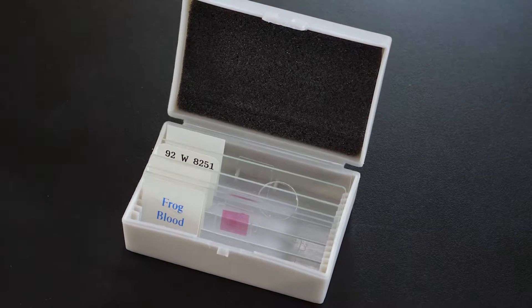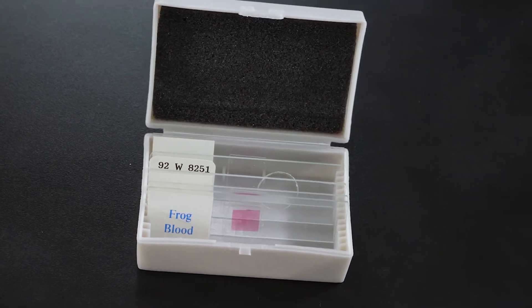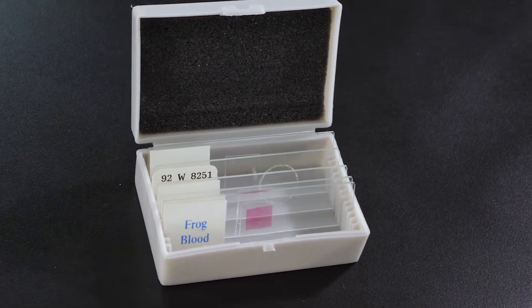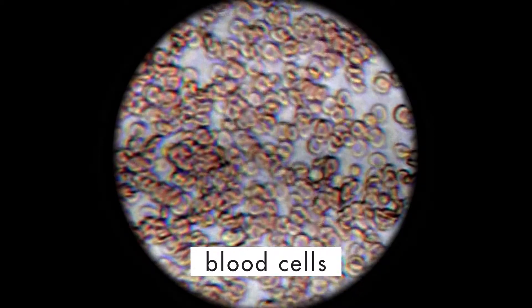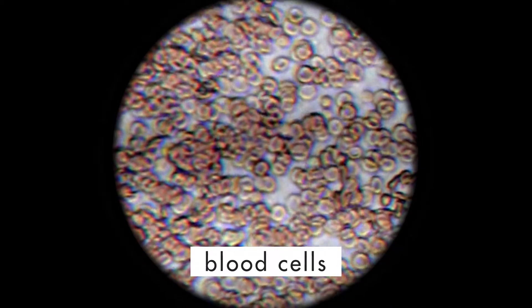Making a permanent mount slide, like the ones we have seen so far, requires special equipment and handling, so it is often easier to purchase these from biological supply companies. However, a wet mount technique can be used to prepare certain specimens for viewing. Wet mount slides are particularly useful for observing specimens, such as protozoans or blood cells, in a liquid environment.